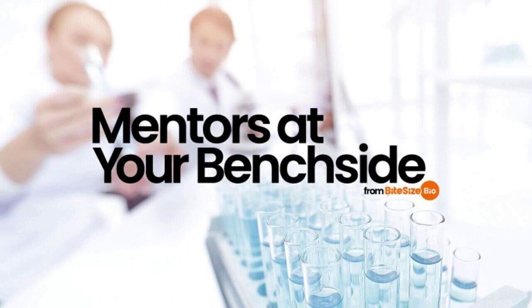Take a look at the options the program returned and pay special attention to the following. Make sure the 3' end of the primer contains a G or a C residue, because a T and an A residue bind more easily to DNA in a non-specific way. Aim for a GC content of around 40 to 60% to ensure maximum product stability, and avoid self-complementarity to decrease the possibility of primer-dimer formation. Ideally, the primer should have a near-random mix of nucleotides. Now pick the best 2 or 3 primers in order and test them.